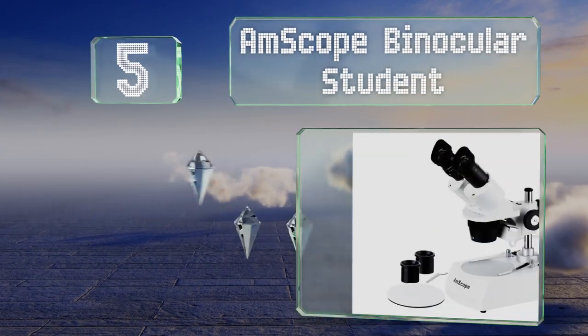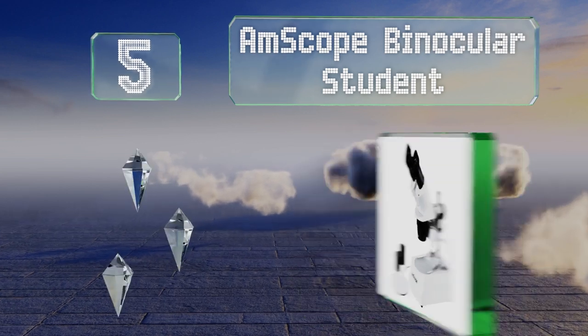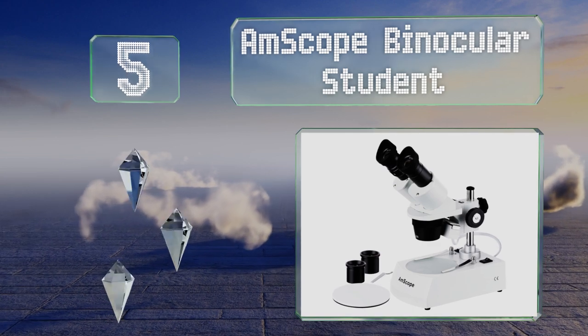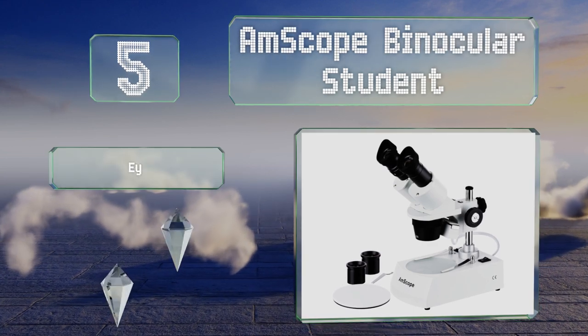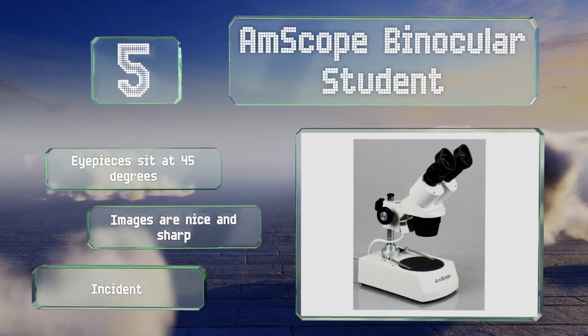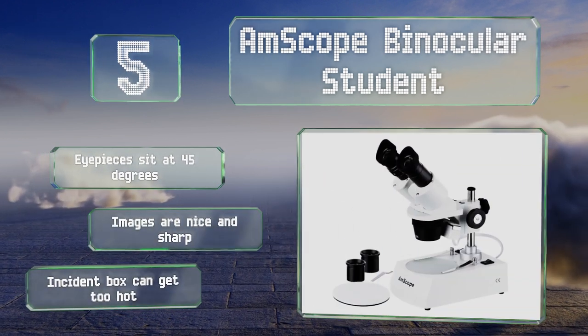At number five, while it doesn't have the same cordless capabilities of its slightly pricier cousin, the AmScope Binocular Student still offers many of that model's other features, like a bright stage light and a trio of magnification options. Its eyepieces sit at 45 degrees and the images are nice and sharp, but its incident box can get too hot.